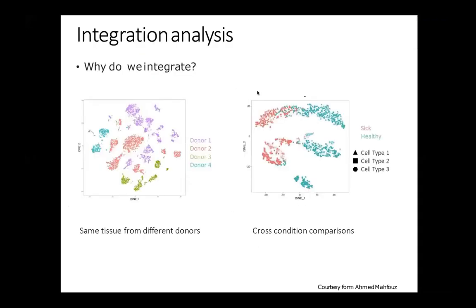So why should we integrate? Here is a picture from a colleague showing what we sometimes see in a dataset where you have several donors or patients and everything clusters together according to the donors, not according to the condition you want to visualize. You don't have cell type one and cell type two clustering together, but clusters made of each donor, within which you can still see sub-clusters representing cell types — but visually it's not appealing for a paper.